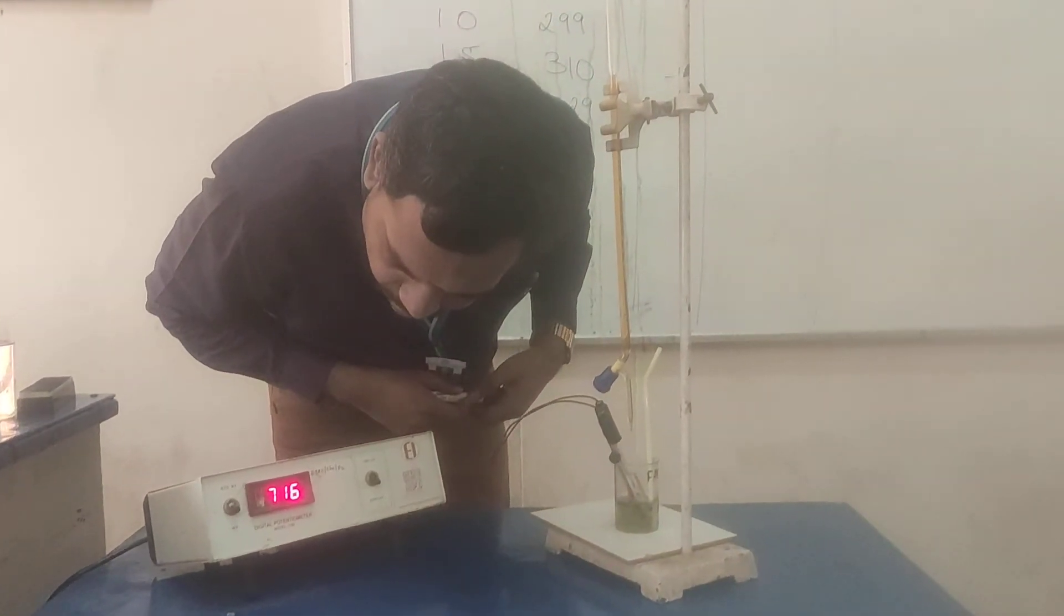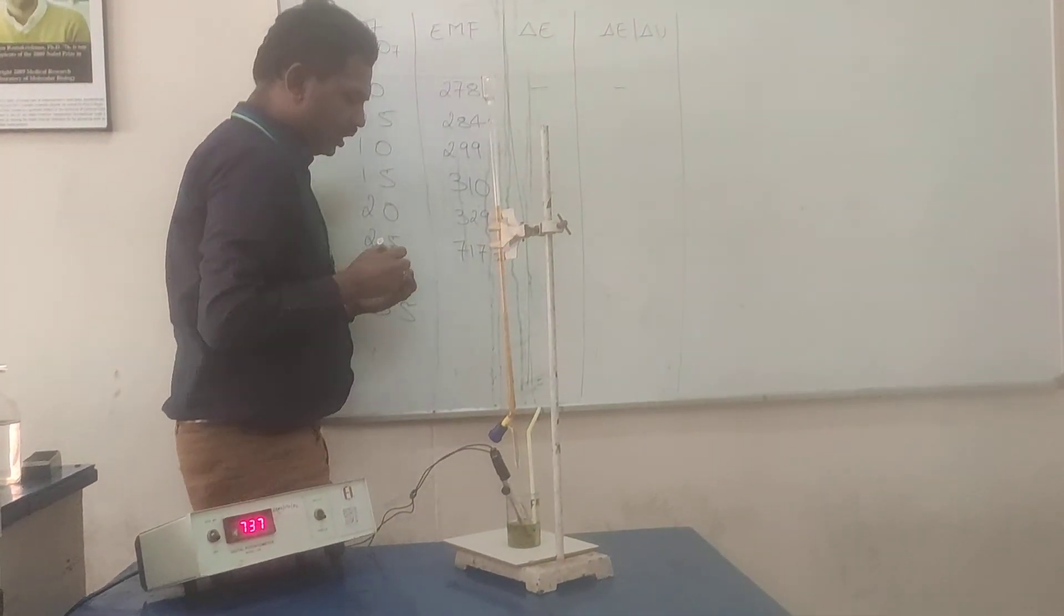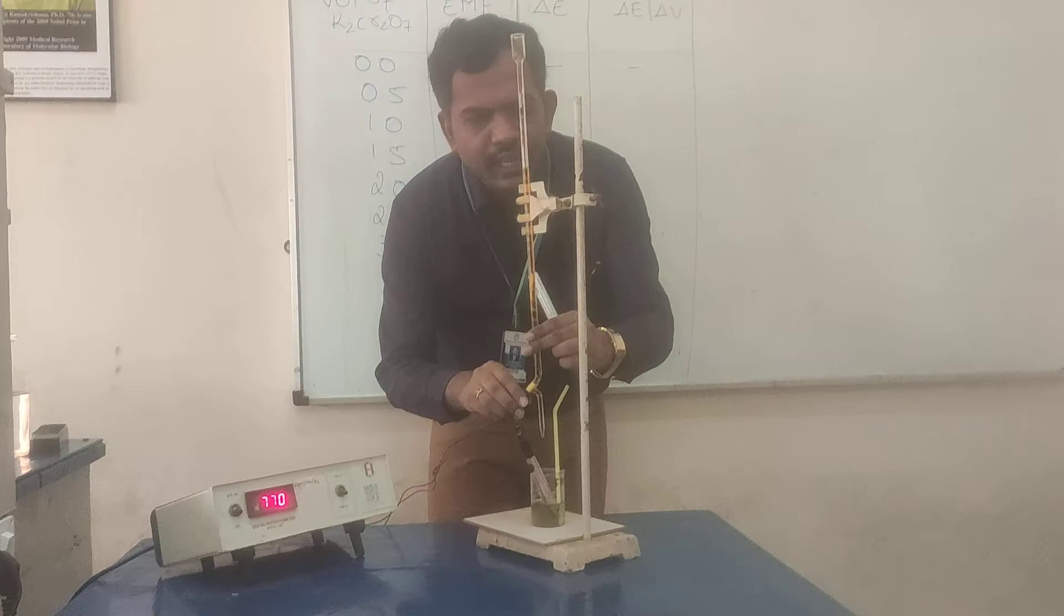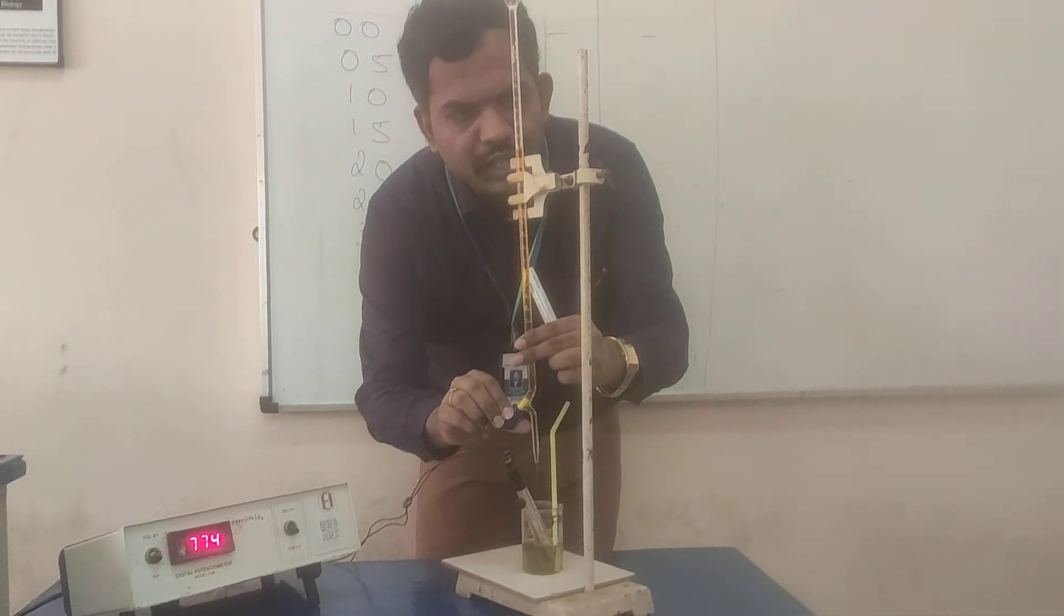Now, let us see EMF. So, EMF is almost, it's around 770. This is our jump. Now, we are going to calculate, we are going to take another 4 more readings and stop the experiment.